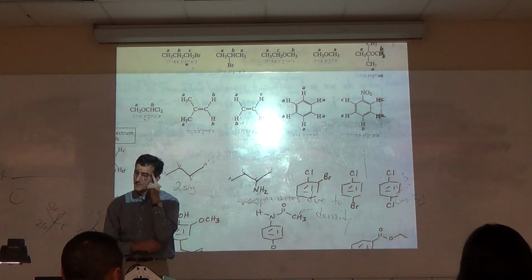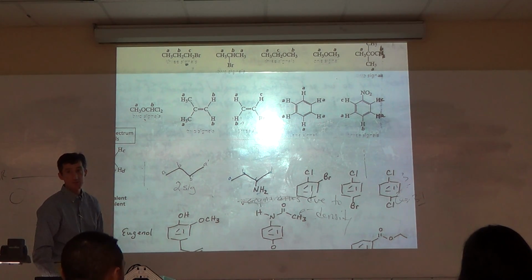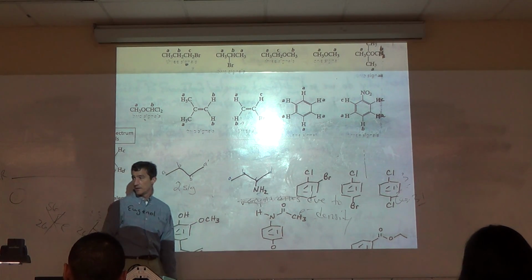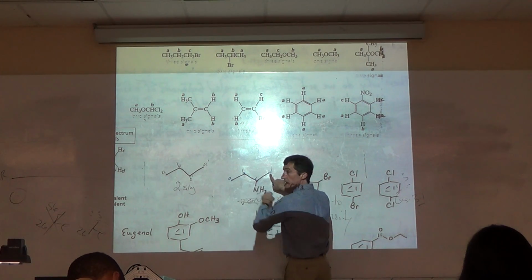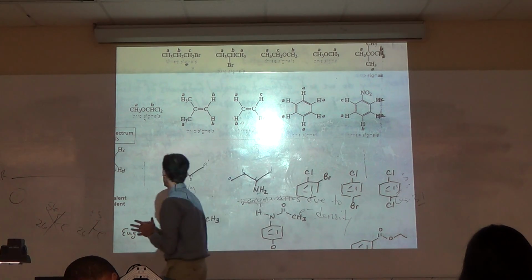I could think they're not. This happens to be a bad example because it gets into something that I don't want to get into. B and D aren't the same because B is bonded to an extra methyl, D is not. Yes, both are one away from the methyl, but B has a methyl bonded to it where D doesn't, and that's enough to make the difference.